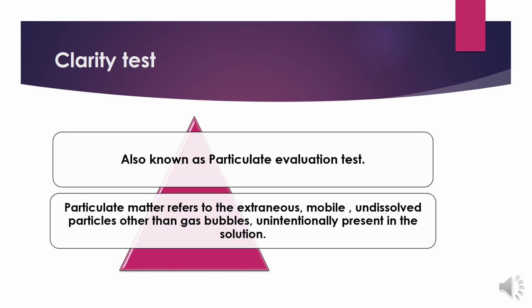So what is this particulate matter that is being evaluated in this test? It says the particulate matter refers to the extraneous, mobile, undissolved particles other than gas bubbles that are unintentionally present in the solution.